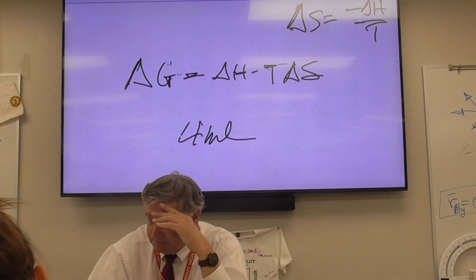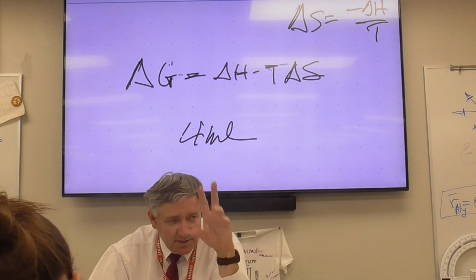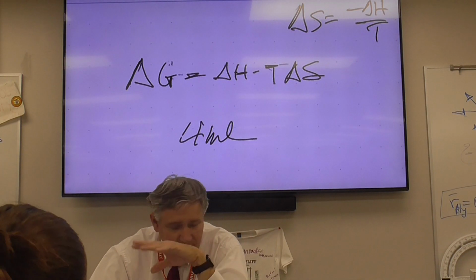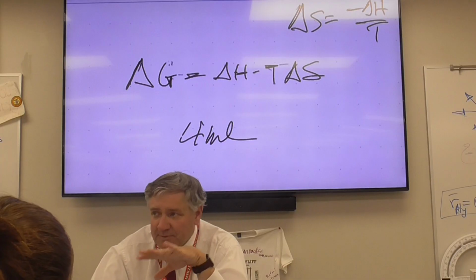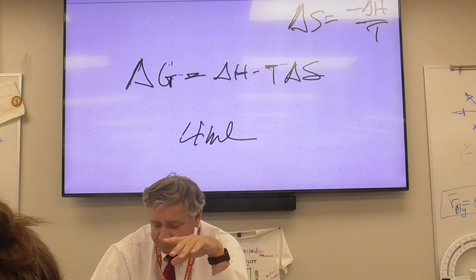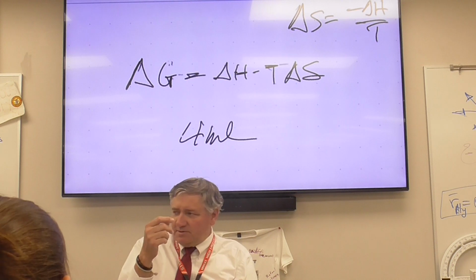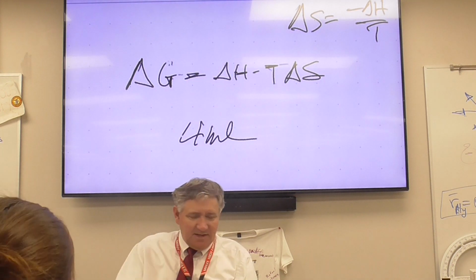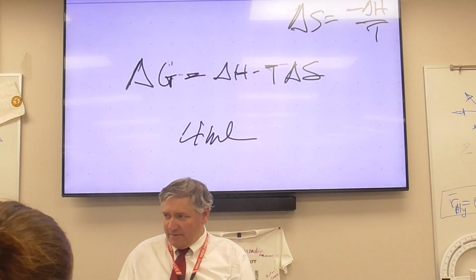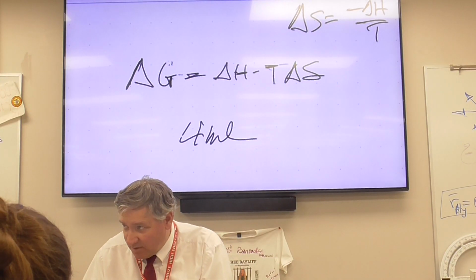Magnesium and hydrochloric acid. Okay, you need to take, again, about 5 milliliters of 1 molar hydrochloric acid. Put it in a test tube, drop in a piece of magnesium about yay long. I'm going to have pieces of magnesium in there. This is more, hey, let's measure the temperature because we know what's going to happen. Sodium in the water: with that one, you're going to take about 50 milliliters of water in a beaker, add some phenolphthalein, and I'm going to drop in a piece of elemental sodium. We're going to measure the temperature before and after, okay? The lab portion of this goes pretty fast.